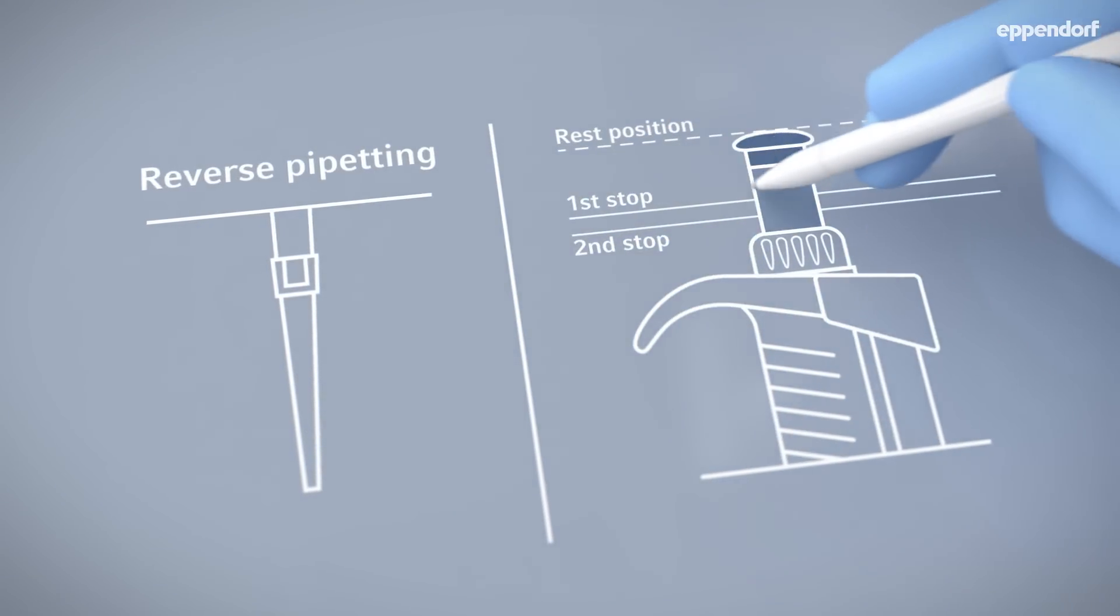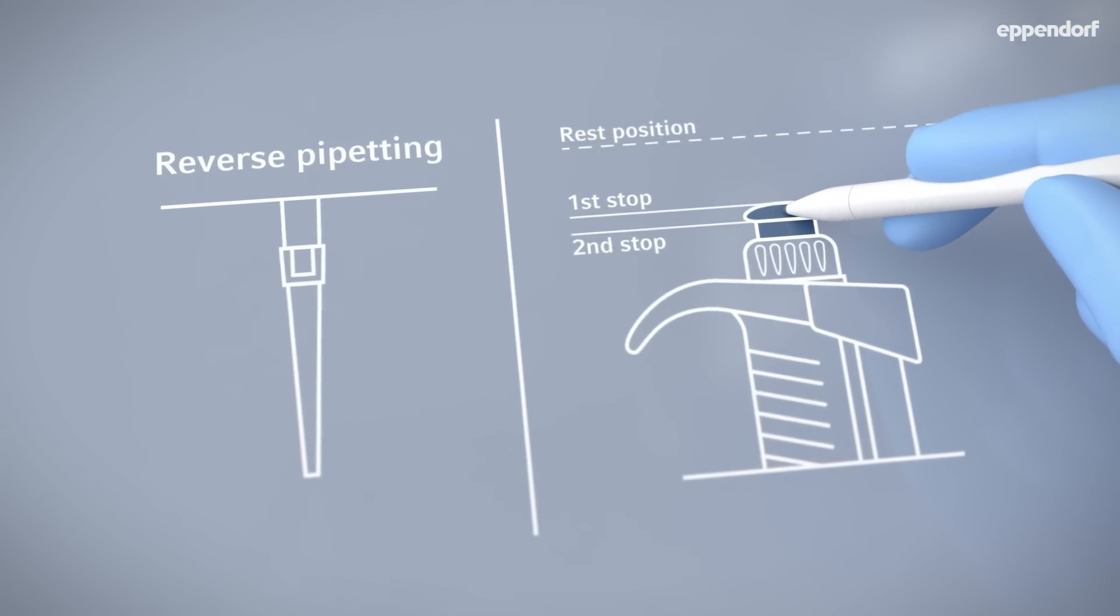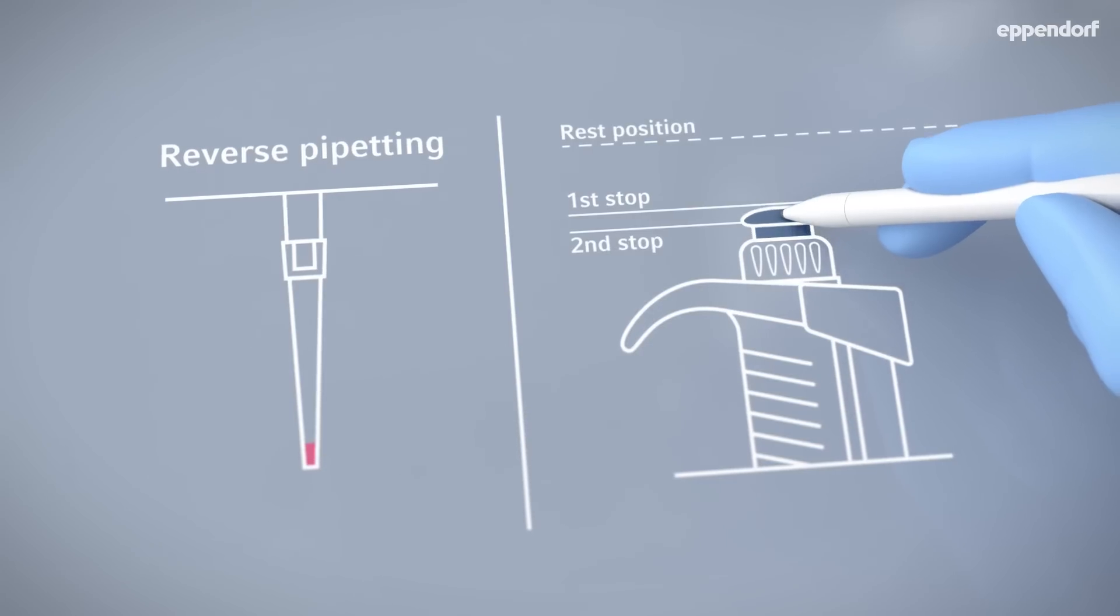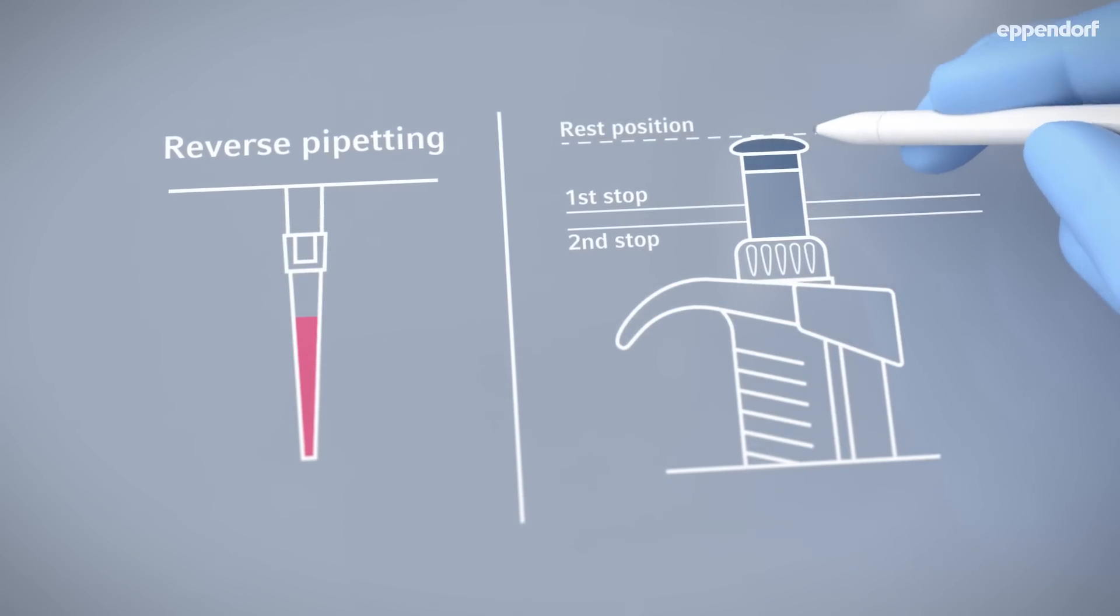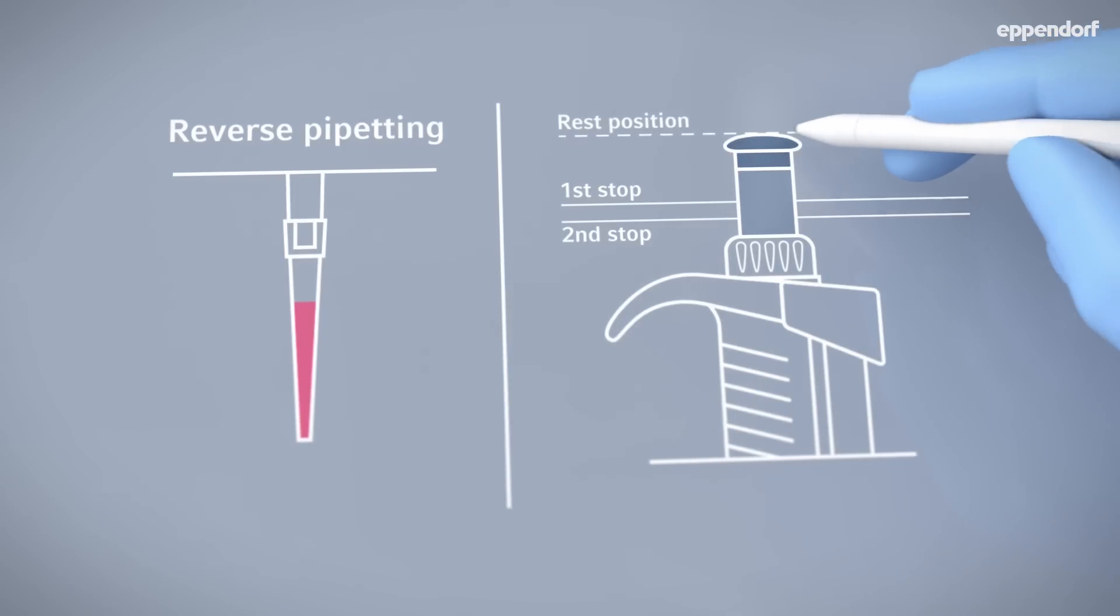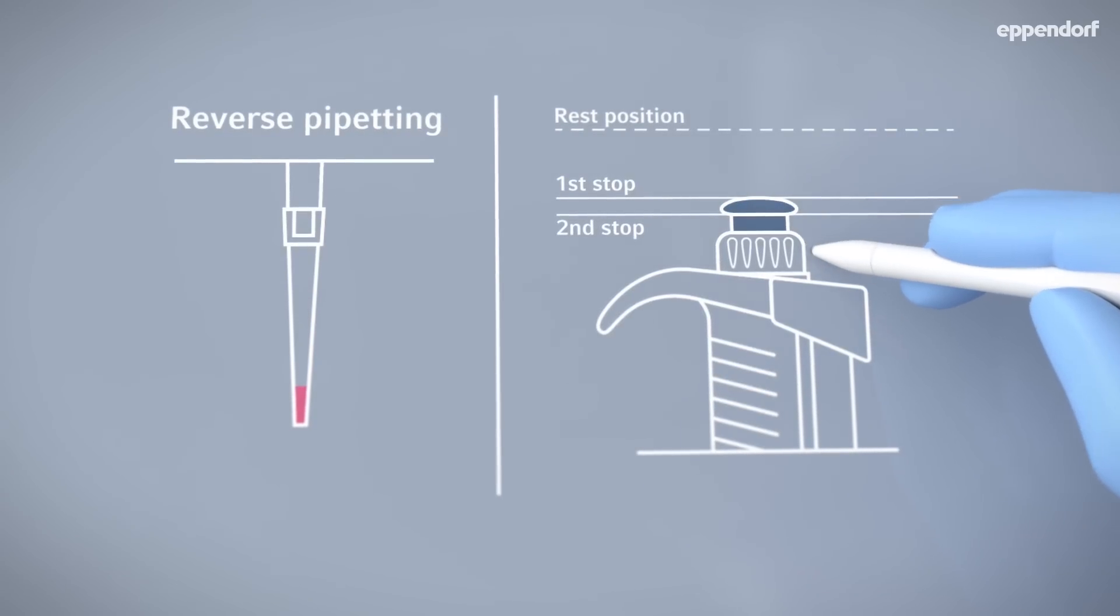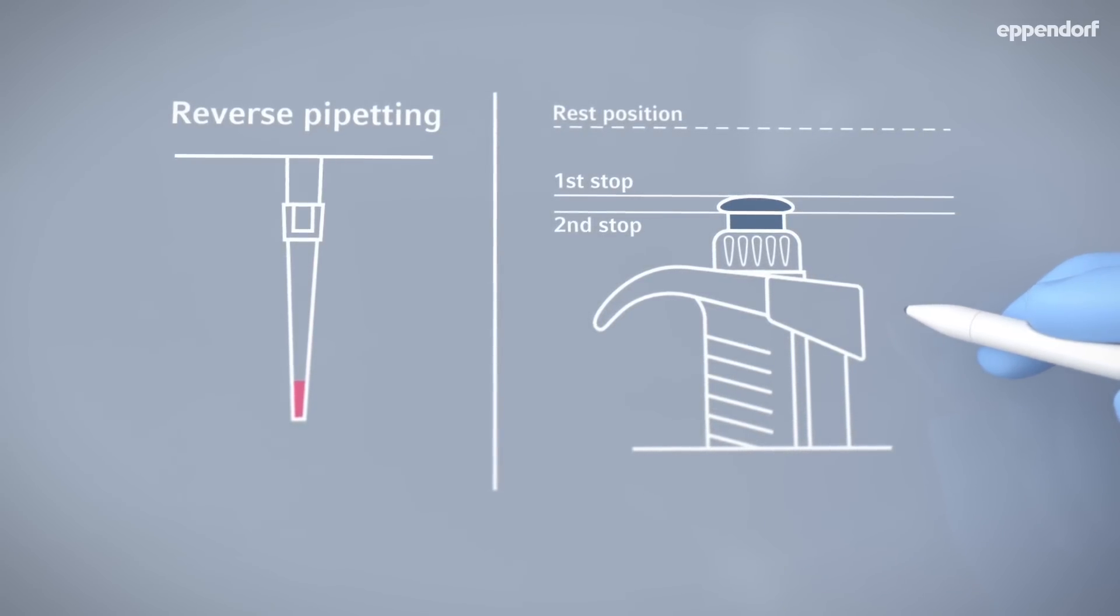Reverse pipetting works better for certain liquids and pipetting challenges. Push the operating button down to the second stop. Immerse the tip and move the operating button all the way up. Dispense the liquid by pushing the operating button down to the first stop. Some liquid will remain in the tip. You can discard it or return it to the aspirating vessel.